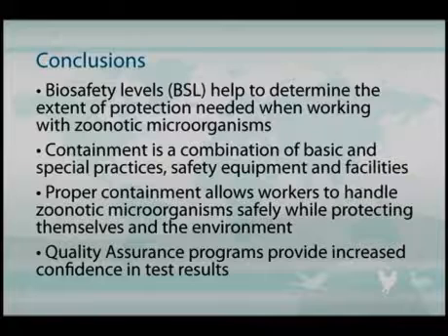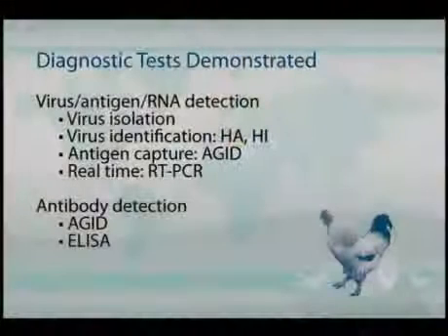And then quality assurance programs provide increased confidence in the test results that come out of a laboratory. So if you know that you are monitoring effectively all of the components being used in diagnostic tests on a regular basis, I think you can expect that the overall quality of the results coming out of that laboratory is probably going to be pretty good.